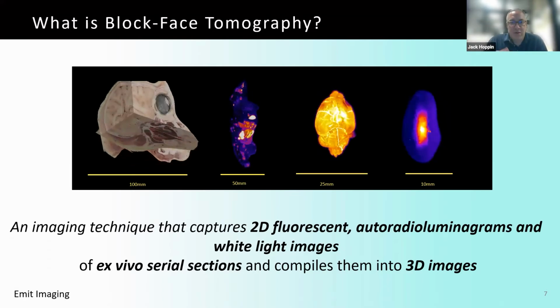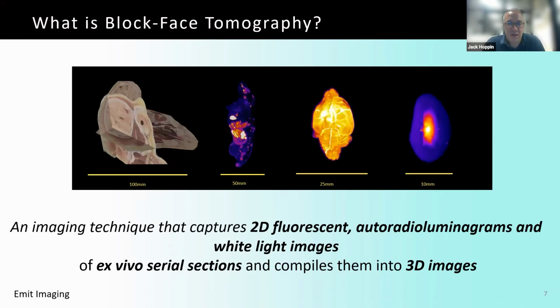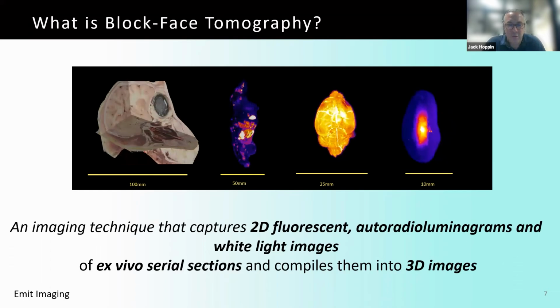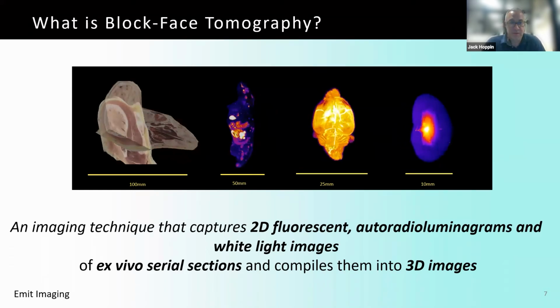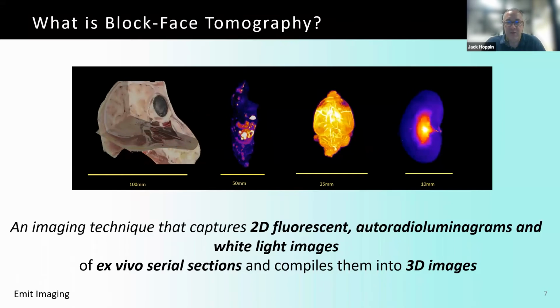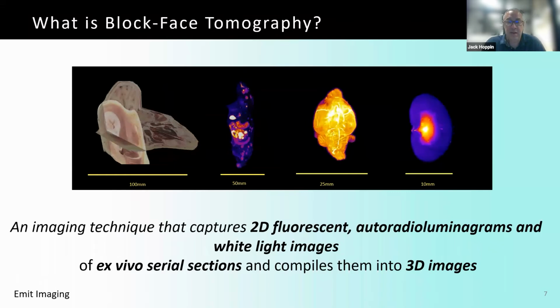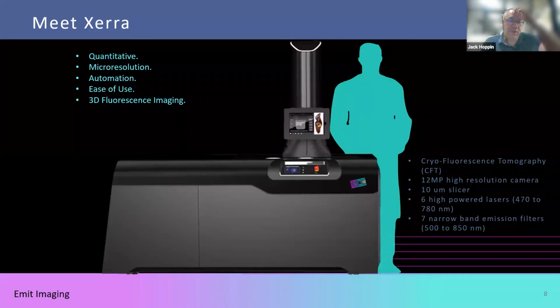So this is a macro, supercellular modality. I'll take you through, zoom into the first plot we had and talk about where this fits. We've used it for just the bright field, just the red, green, blue. We've used it for radioisotope imaging, but its primary application is in fluorescent imaging, and I'm going to show you how that works.